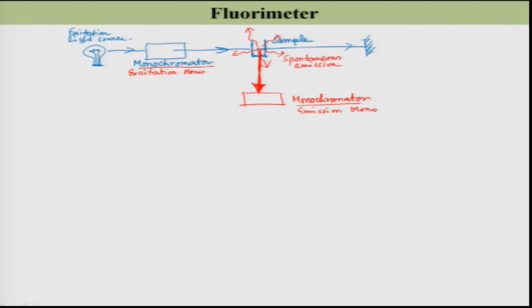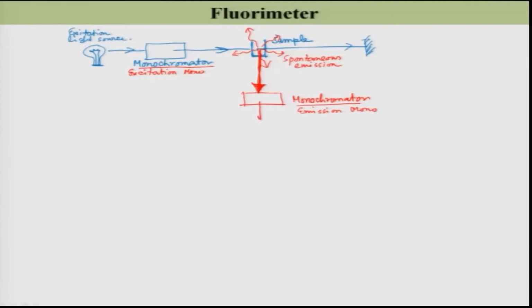right. So, after passing through this monochromator, this will be dispersed and will be able to get the individual wavelengths, right, depending on the slit width obviously. So, now this is guided to the detector. So, I am going to have this detector over here, this is my detector similar to that detector I discussed in spectrophotometer.